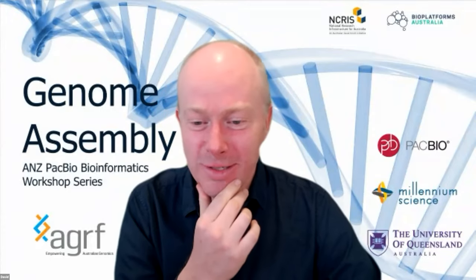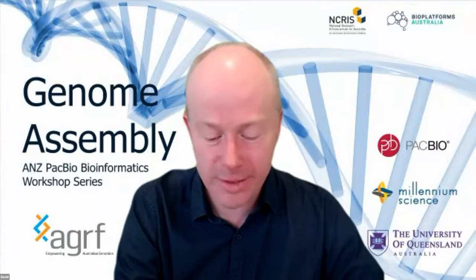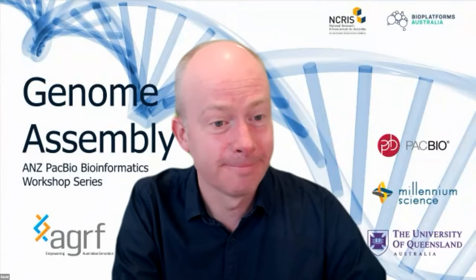Alamendra asks, have you considered doing flow cytometry to know the size of your genome before sequencing? That has been mentioned to us as well. That's not something we tend to do. We just tend to do a bit of short read sequencing, because then we can also use that short read data to polish the genome if we need to. And I know with HiFi, you're not supposed to need short read data to polish a genome. But as you know, David, our DNA is not optimal, even though we flash freeze our samples and do our very best to maintain the quality of the samples. Sometimes we do need it. So that's the reason we've chosen to produce the short read data rather than flow cytometry.